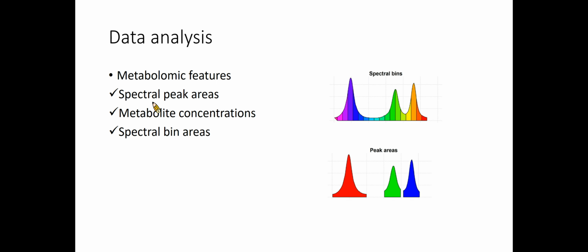Once this data has been analyzed, the identification of the metabolites representing the relevant peaks is required in order to provide biological meaning to the results. In contrast to the previous features, metabolite identification can be performed prior to data analysis in order to obtain absolute or relative metabolite concentrations to be used as input for data analysis.